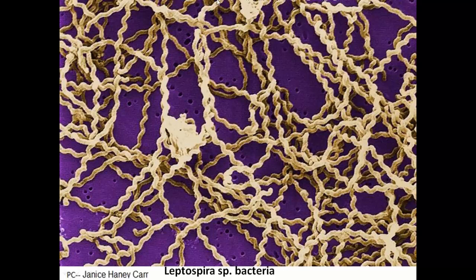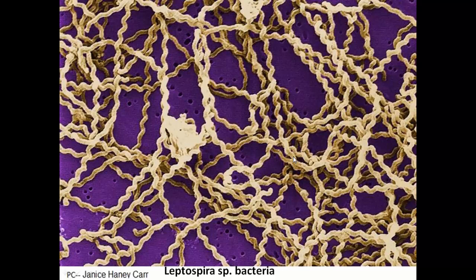This image is showing Leptospira — these golden, spring-like structures are Leptospira. The blue part is a filter where they have been caught and were not able to pass through. This entire image was taken by an electron microscope.